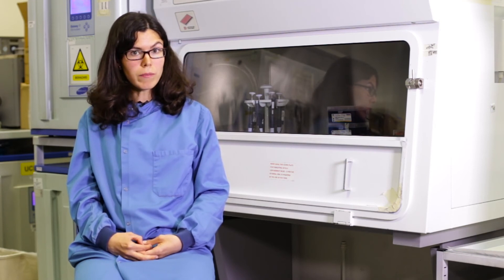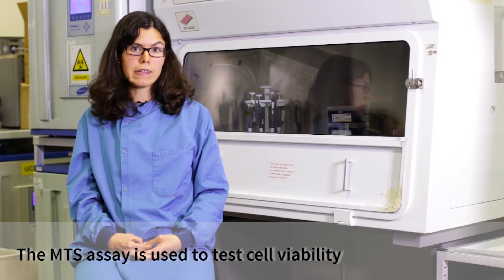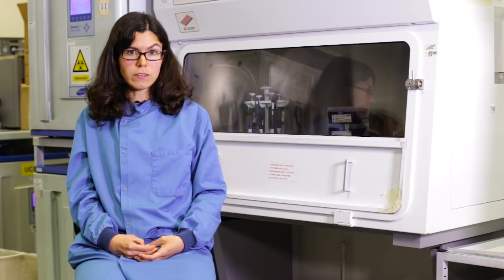So far, I have shown you how to seed cells in wells and how to passage cells. Now, I will show you how to perform an MTS assay, which is used to test cell viability under different conditions. These cells have been treated with different doses of the oncolytic virus I use in my studies. I will now test or assay the amount of cell death resulting from these treatments.